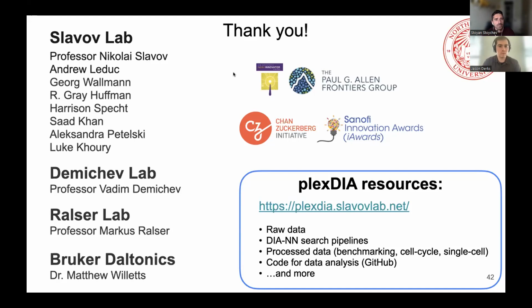So is the identification confidence affected because of complexity? It could be. Yes, it could be. Because the way that DIA-NN is going to identify things, to my understanding, is that it's going to take correlations of MS2 fragments to the elution curve at the MS1 level, among other things. And so if there are some interferences as a result of complexity, you could potentially have lower confidence in identification. There are other things, like side reactions, that might reduce your coverage that way because you're literally going to have less abundant precursors. But this is something that results from anything that you label.